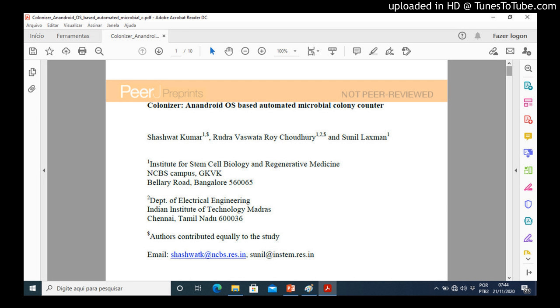The smartphone is attached to the lid such that the camera lens aligns with the hole in the lid. The lid is vertically adjusted to focus the cropping circle on the inside boundary of the petri dish, as also shown in figure 1D.